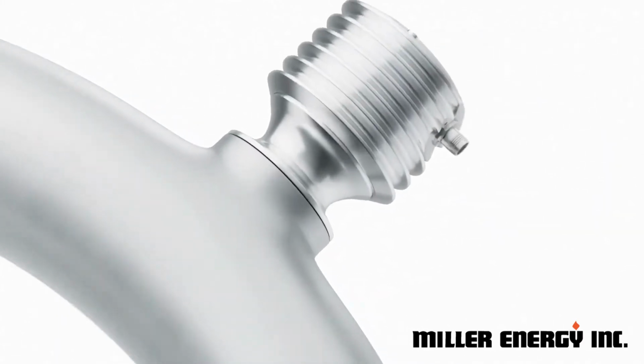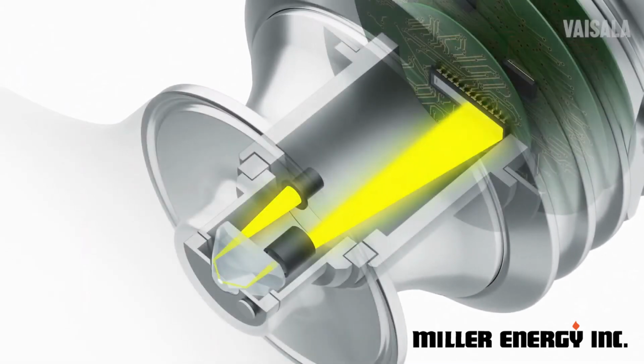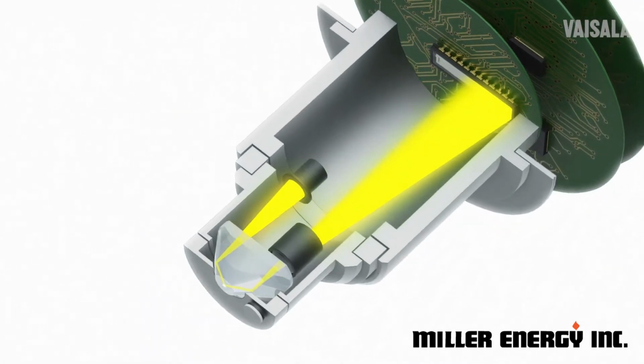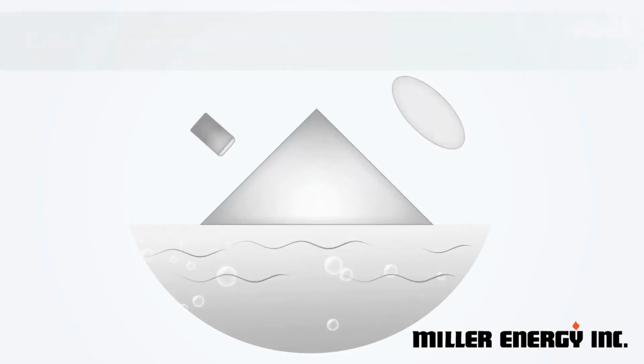The light source sends light rays in different angles to the prism and process interface. Rays with a steep angle are partly reflected to the image detector and partly refracted to the process. Rays with a low angle are totally reflected to the detector. The angle from which the total reflection starts is called the critical angle.